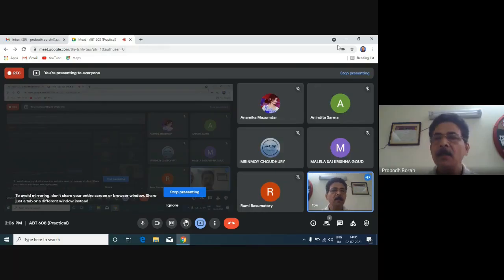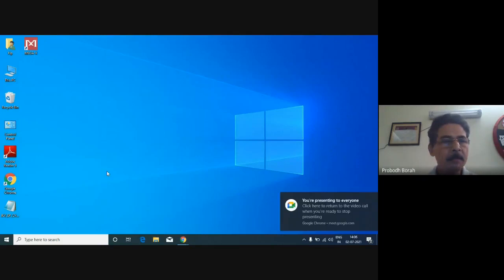We'll be repeating the practical that was done in the last class, but today we shall be taking a different approach. It's an alternative way of doing phylogenetic analysis, and today we shall take DNA sequences instead of protein sequences for phylogenetic analysis. I think my desktop is visible to you.